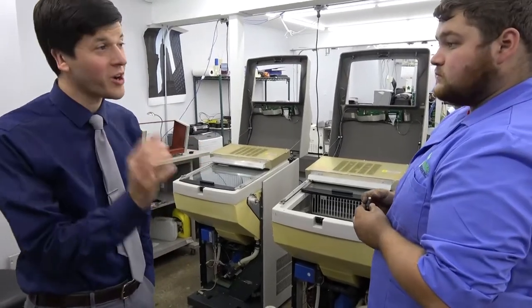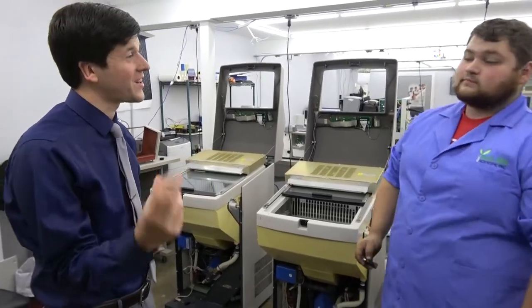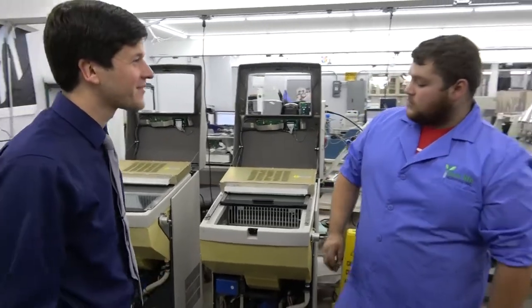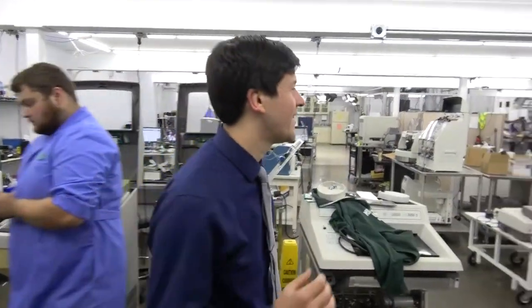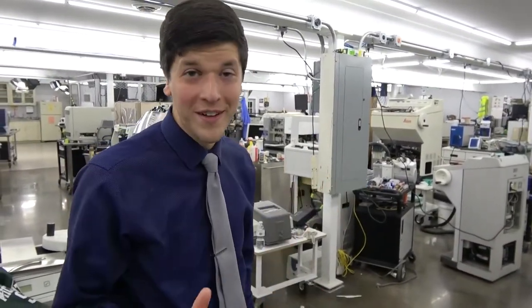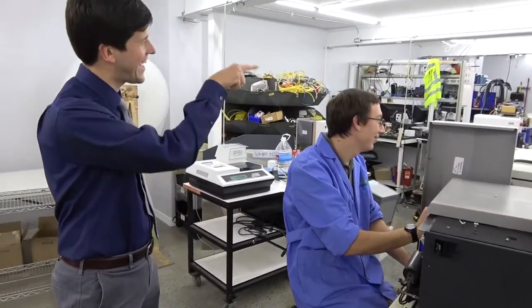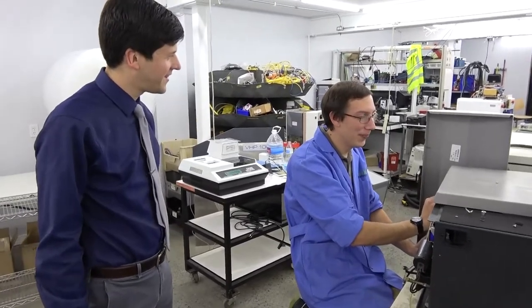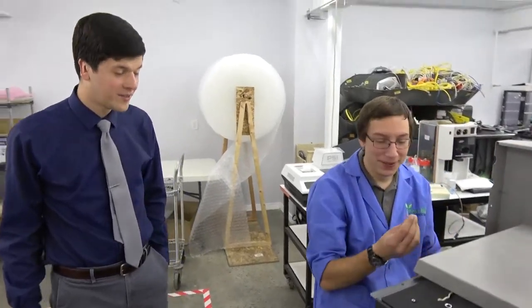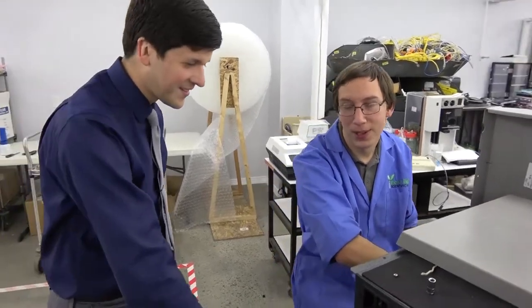Rob, you were the first person to ever show us a part being removed from a system live during a Tech Shop review — good television right there. We're going to go see what Bart's doing. We're not in his standard area this time — he always has us in that one nook, but we're moving today. I didn't know you actually worked over here, Bart — I thought you could only work on that end of the tech shop.